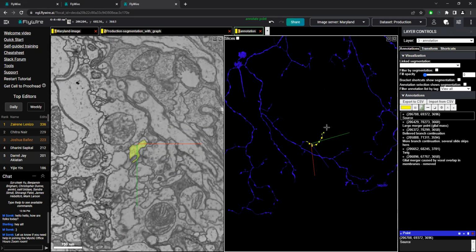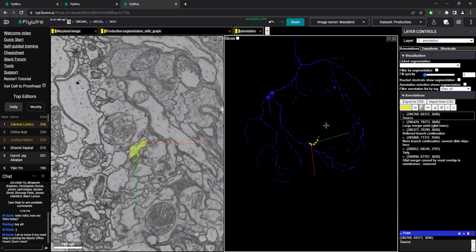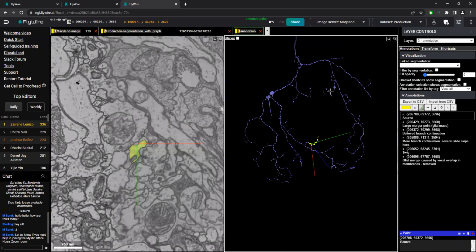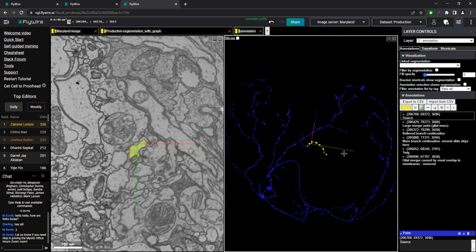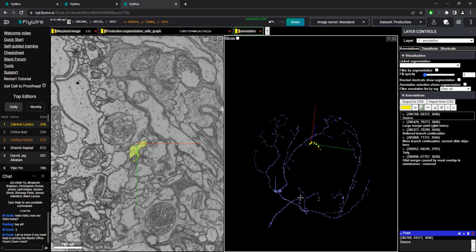So we'll get pretty familiar with what these cells should look like, but it's very handy that we already have the overall structure of the cell built out. So it's a lot easier to see where there is a merger, like, this one's definitely got a merger here, and this is a merger down here. And where a branch doesn't look like the rest of the cell in terms of its growth. Even if it's something as sparse as this, maybe we can see that this belongs with the rest.